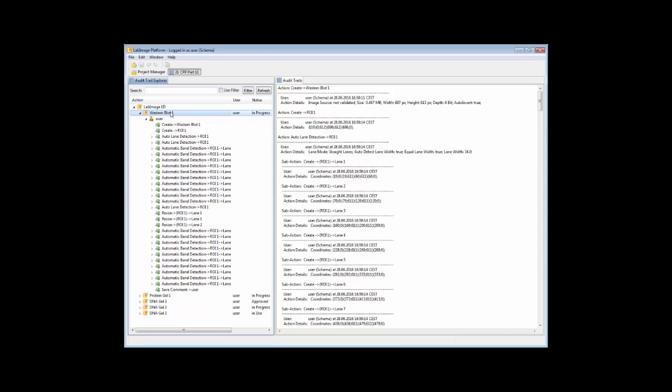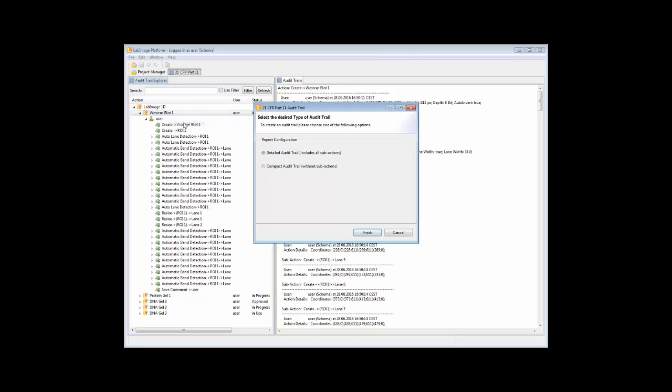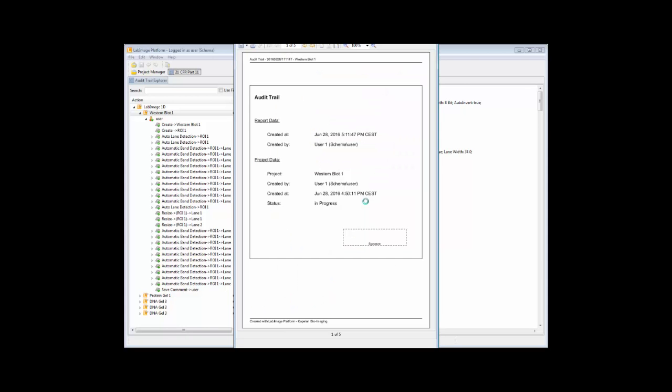To generate audit trails, you click on create report and you can select either to show a detailed report or a compact audit trail. This will provide you with a PDF report containing all the needed details.